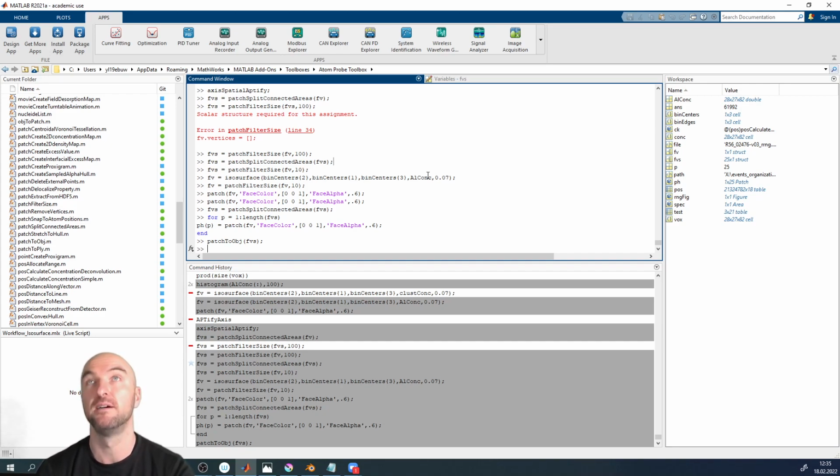It could be hit multiplicity, it could be charge state, it could be reconstructed X and Y versus hit index. It could be anything you can come up with that represents a generalized distance. If it makes sense or not, I don't know. It depends on what you want to do.